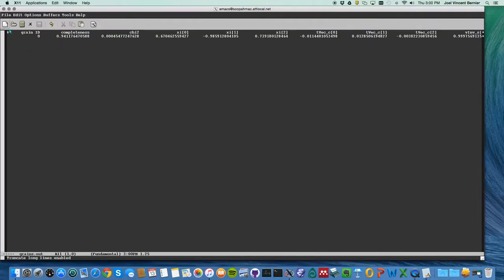But if we look through, after the header, there'll be a row for every orientation that we fit in that accepted orientations .dat file. So notice my completeness, I have 94% of the reflections that I'm looking for all the way out to the edge of the detector. Chi-squared is a normal type of chi-squared fit parameter. It gives you goodness of fit. Something that's 10 to the minus 4 is definitely good.